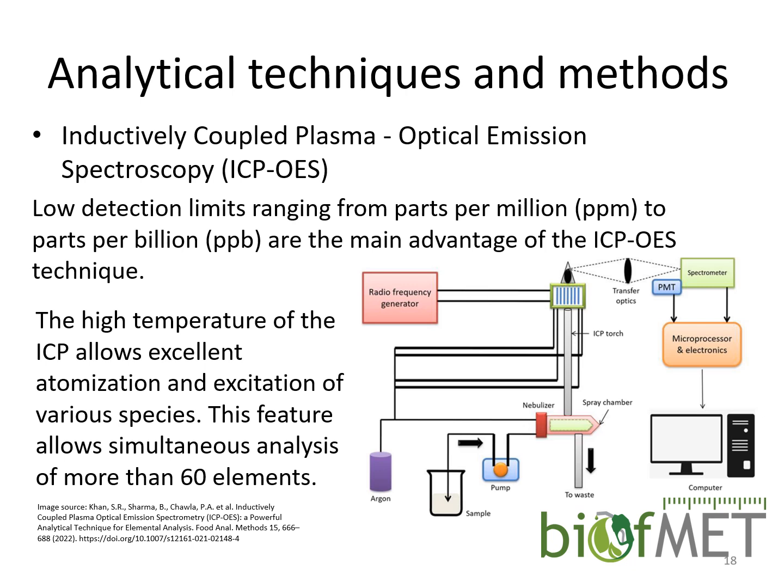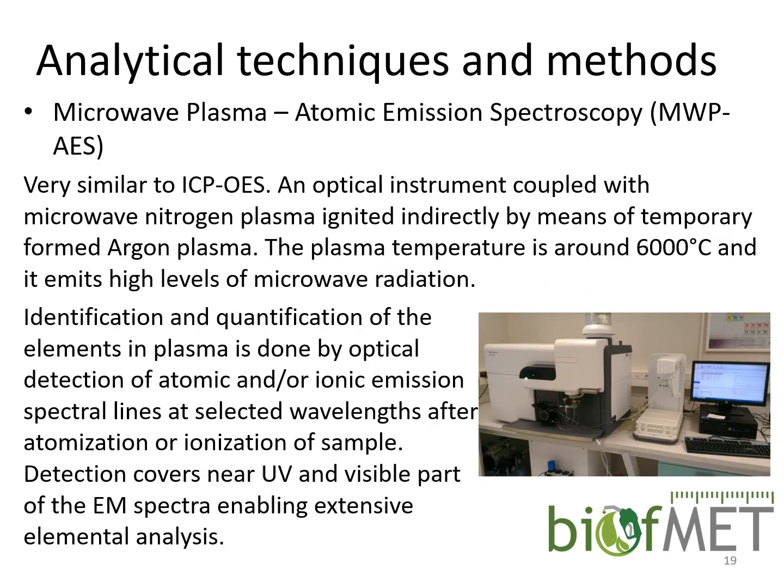This type of instrumental analysis is very suitable for the analysis of more than one element at a time in the sample, because the detection system allows you to detect more than one different emission spectra from the torch of all the existing elements there.